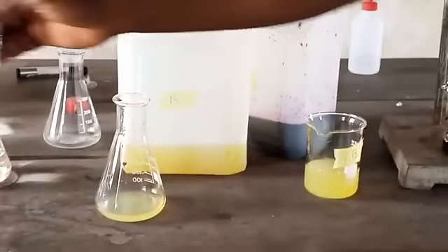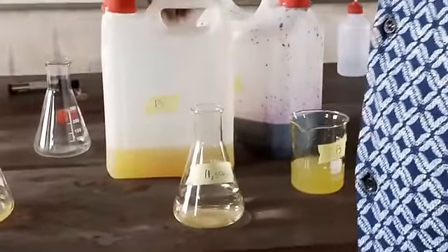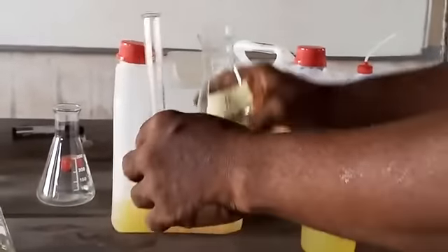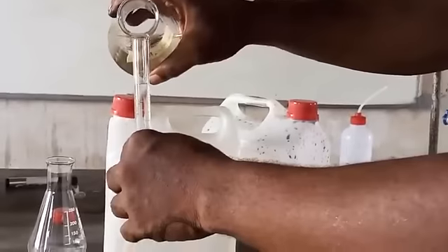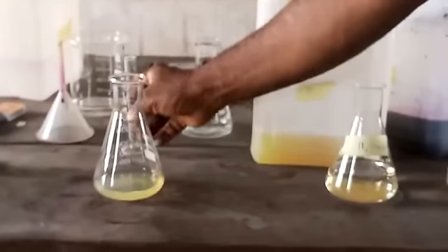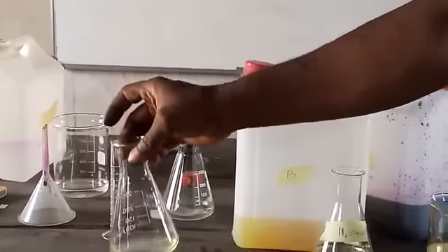We're also asked to measure 10 cm cube of dilute H2SO4 and add it to solution B. So we use a smaller measuring cylinder and collect 10 cm cube of this acid, and pour it into the conical flask. So we have a mixture of solution B, 25 cm cube, and 10 cm cube of dilute H2SO4.